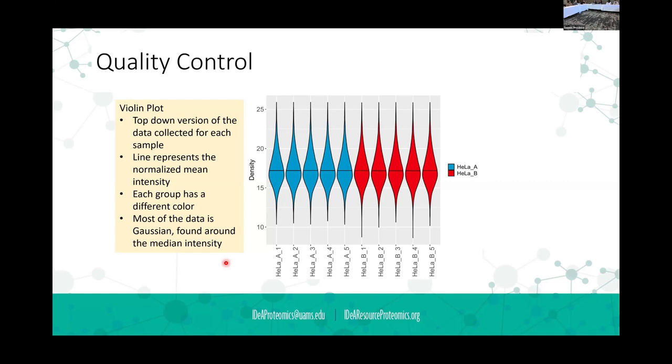Yeah, so follow-up question, I was wondering about the same idea. So now I understand that we're making the assumption that the majority of the proteins do not change, and we're using this as a way to normalize it. So then. Well, actually, you're not using that to normalize it, you're actually using that as an evaluation after you normalize, because you don't want the normalization to impart that half the proteins have a twofold change.